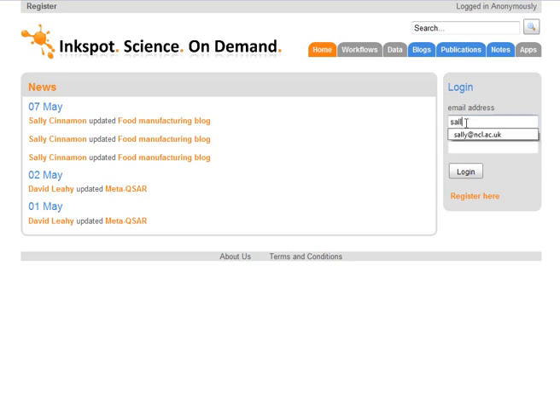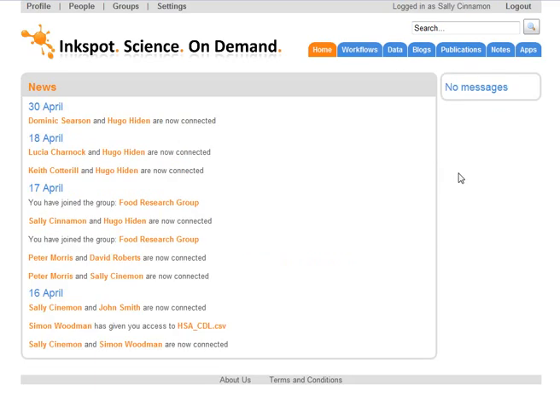We're now going to log on as Sally, who's interested in analysing data from the food manufacturing facility where she works. Now that Sally has entered Inkspot, the news page has been updated to show activity that's happened recently within her circle of collaborators. Also, note that the full functionality of Inkspot is now available for her to use.